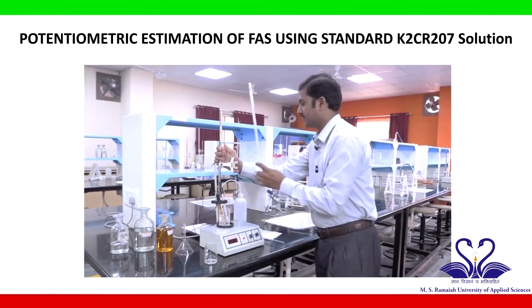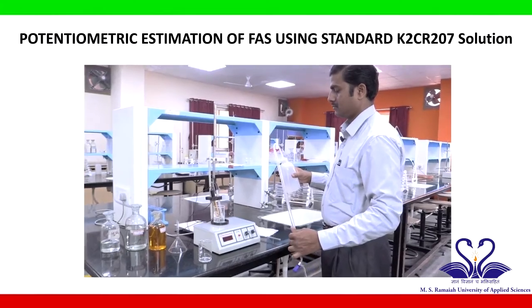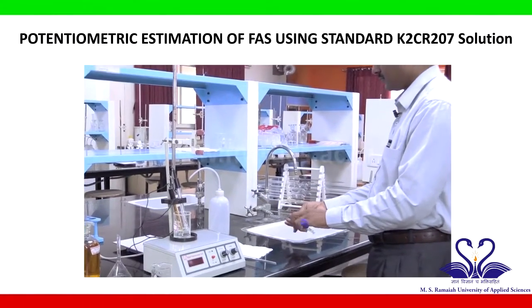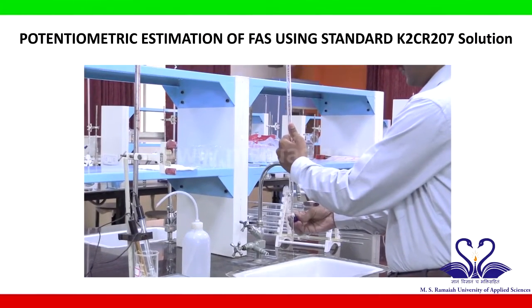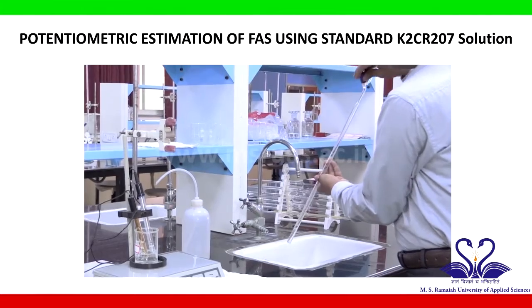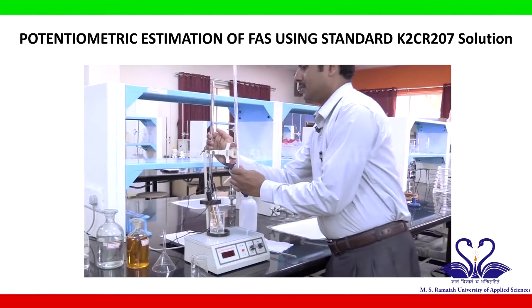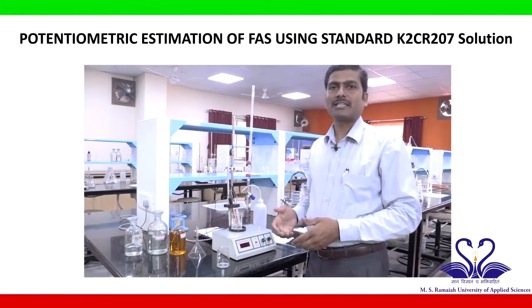Then the burette needs to be cleaned. Now we have cleaned the apparatus, then we have to start the experiment.